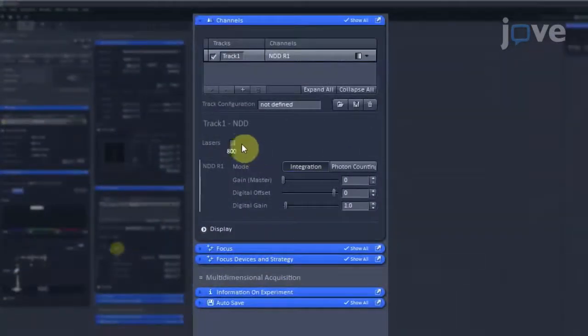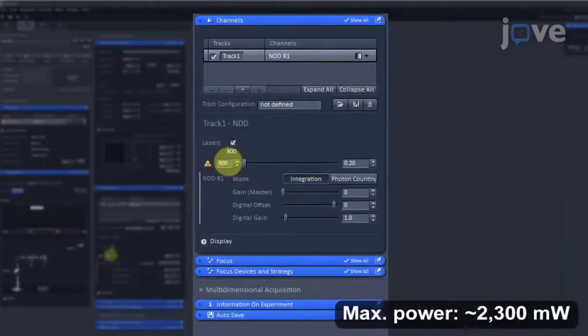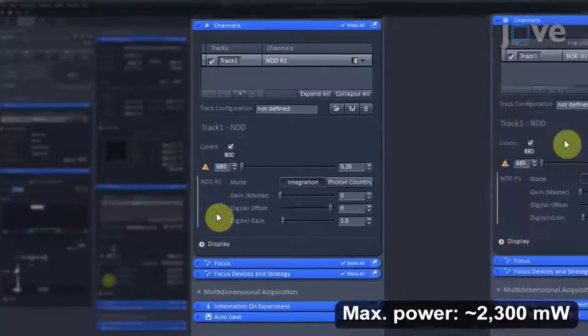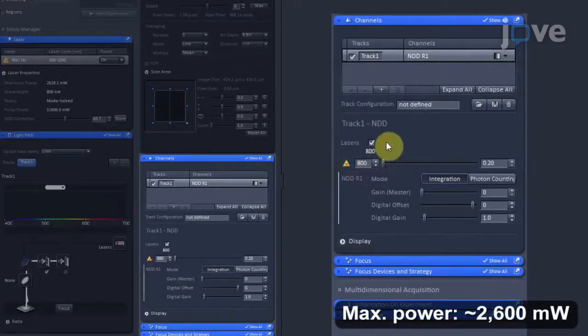On the Channels tab, set the laser's wavelength to 880 nm for eGFP ablation or 800 nm for GCAMP ablation.